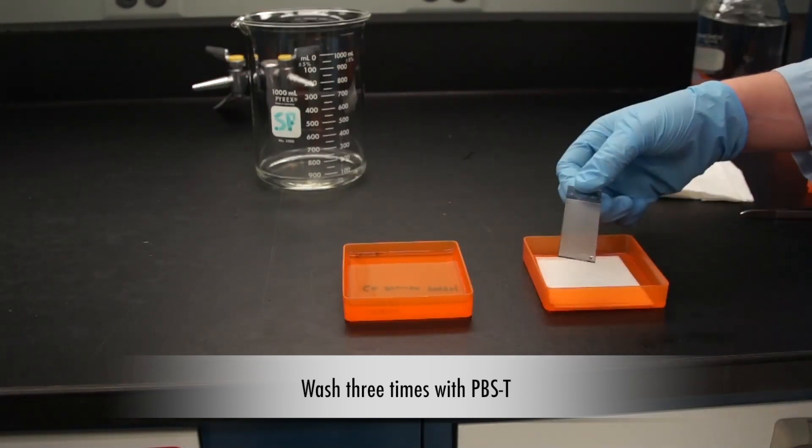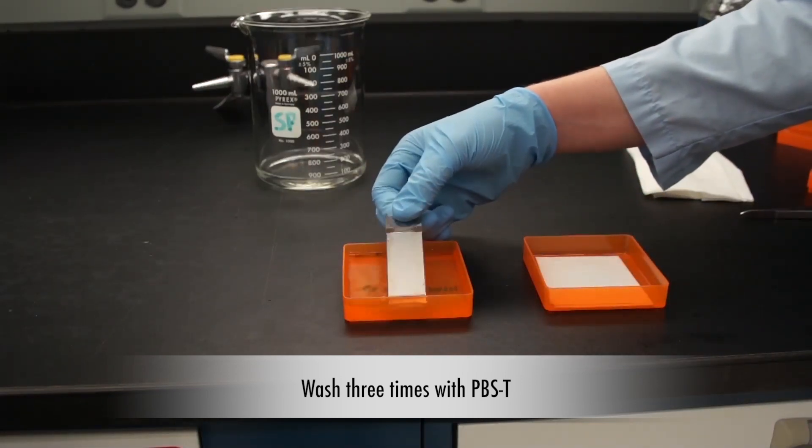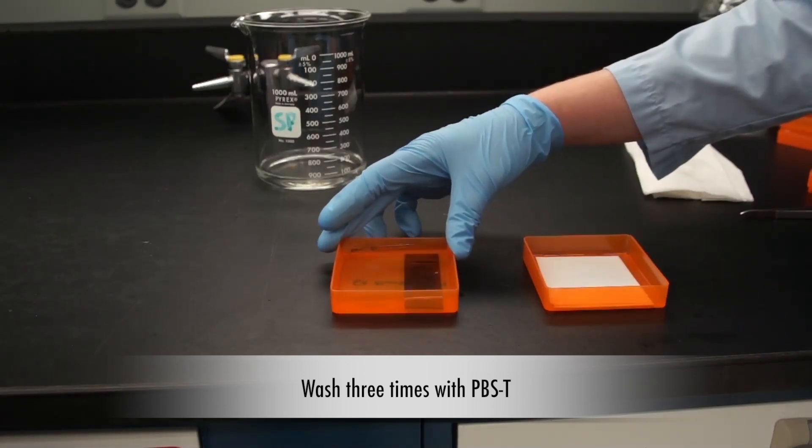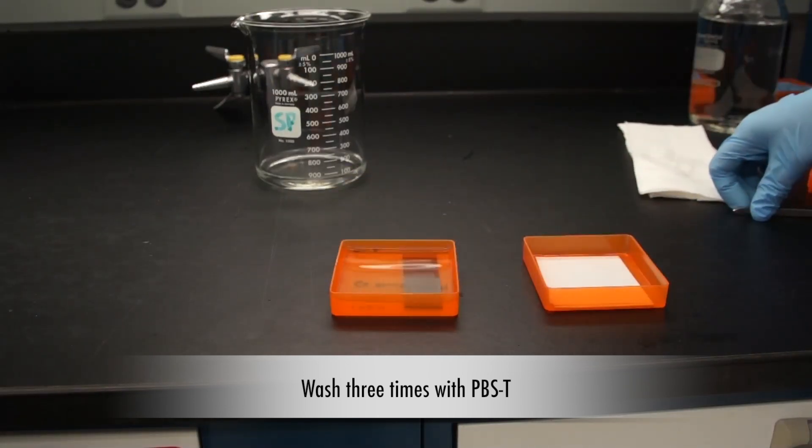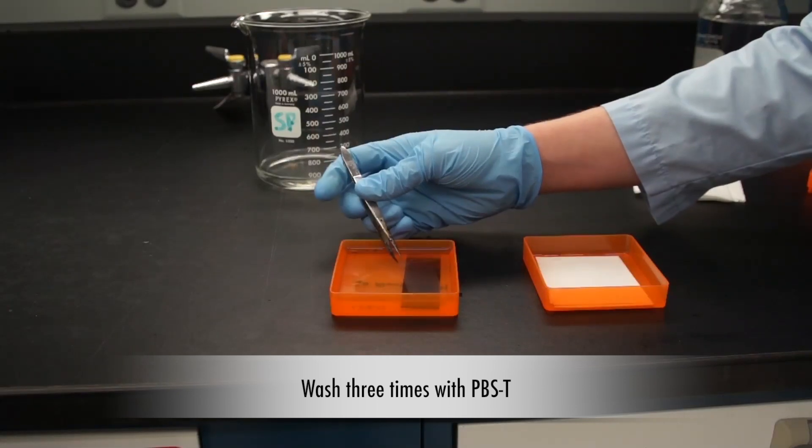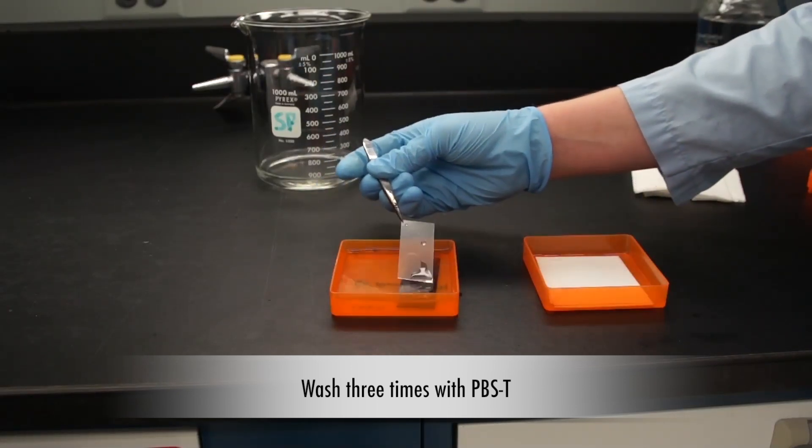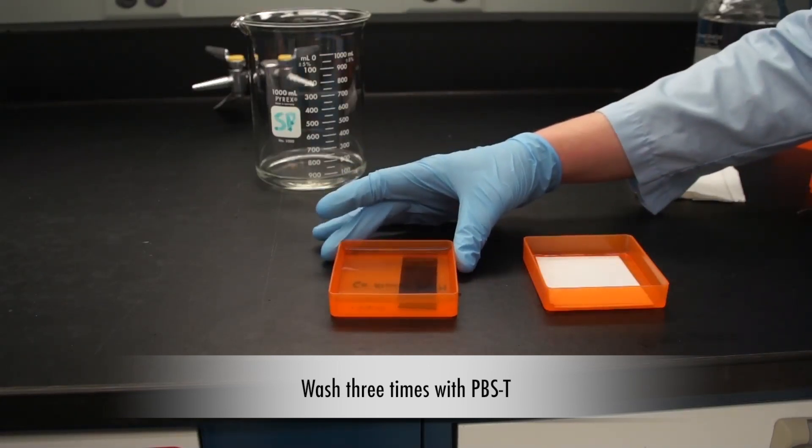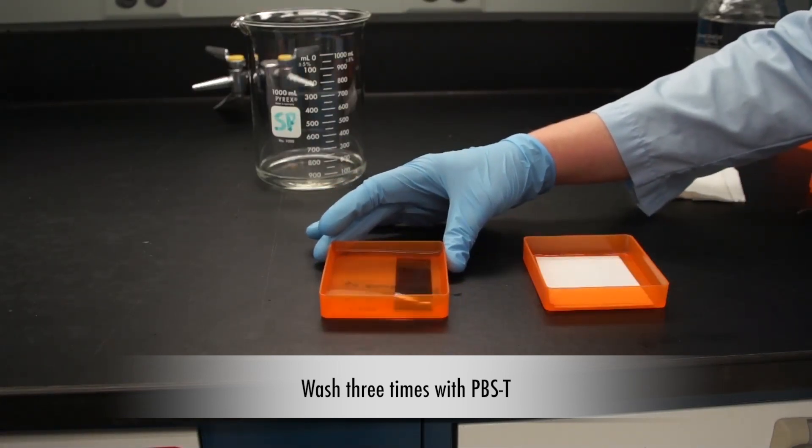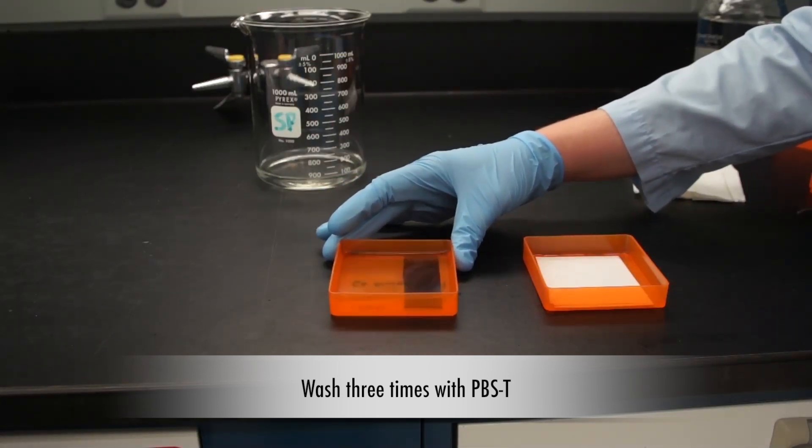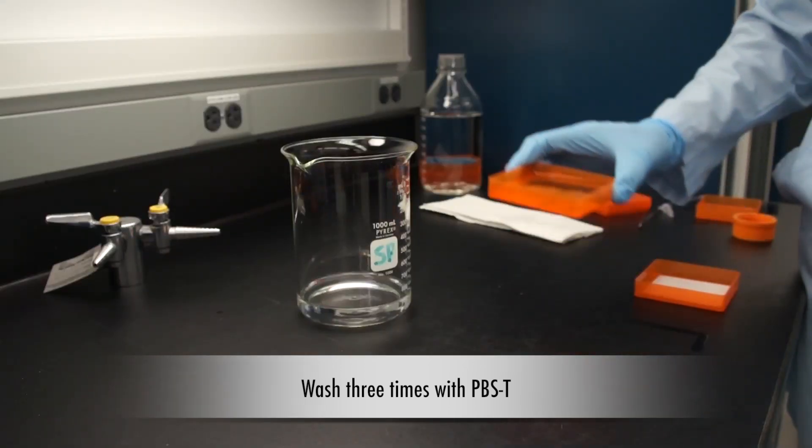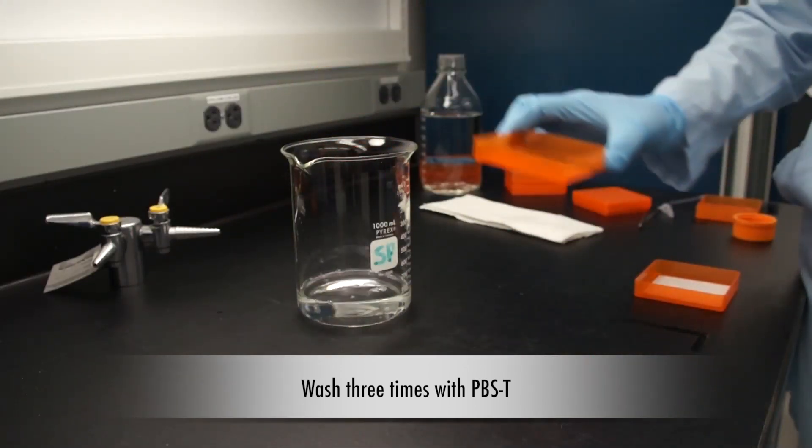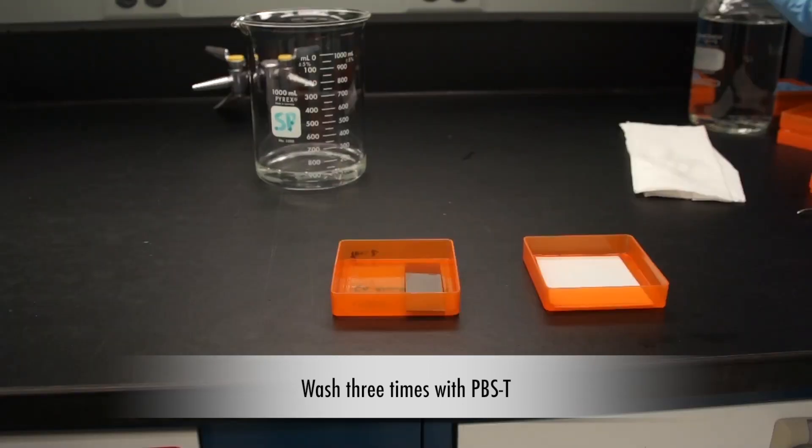Gently drop the slide into PBST buffer. Shake the slide for 5 minutes at 4 degrees Celsius. Drain the buffer from the chamber and wash twice more with PBST.